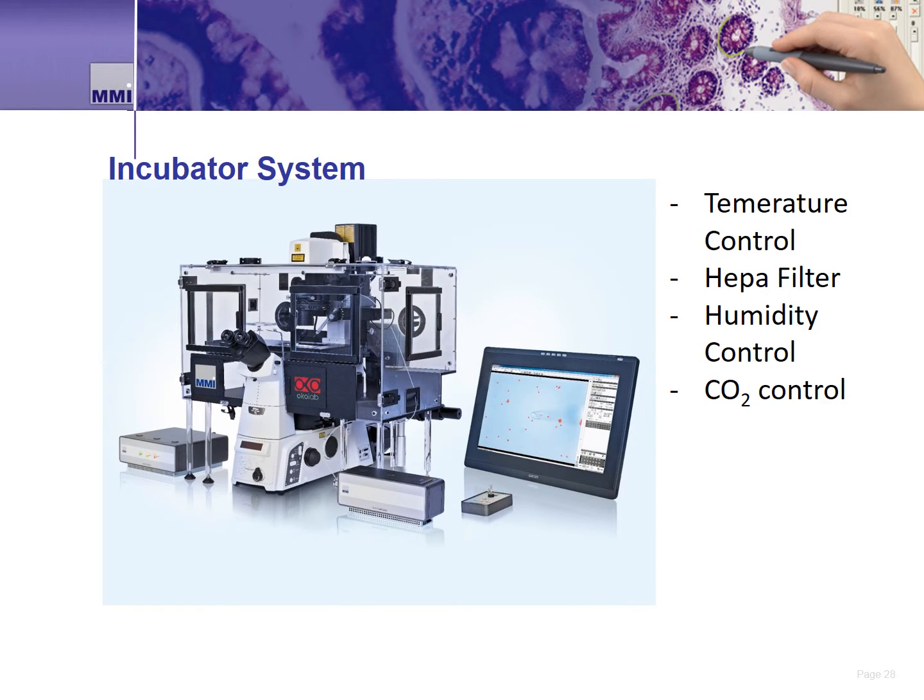For sensitive or longer-term live cell dissection applications, researchers may require a climate-controlled system to keep the cells healthy and alive. For this, MMI offers an optional climate-controlled, filtered, and CO2-controlled incubator for the CellCut system. The incubator is mounted onto the microscope and over the CellCut stage, giving researchers a way to conduct long-term dissection applications — for example, the dissection of several thousand cells over several hours.